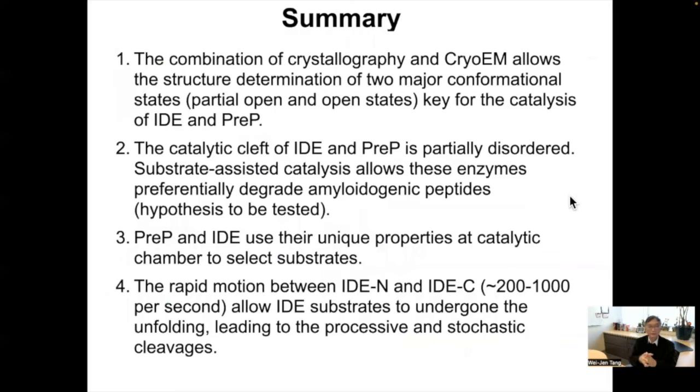This is a summary slide to say that we now have a much better idea of how this enzyme works. We're now taking advantage of the chameleon spotiton technology to do time-resolved cryo-EM, with the hope that we can capture the initial reaction of this enzyme.